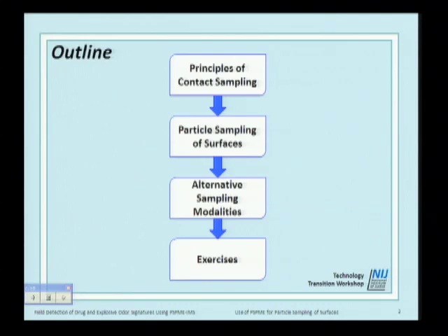So the outline for this talk, we're going to talk about the principles of contact sampling. So far, the PSPME applications we did in the laboratory yesterday have been non-contact. Okay, so we've been sampling volatiles, either static or dynamic, non-contact. And there's a lot of interest in non-contact sampling, but primarily what's done currently out in the field is contact sampling. So we felt we needed to cover this.